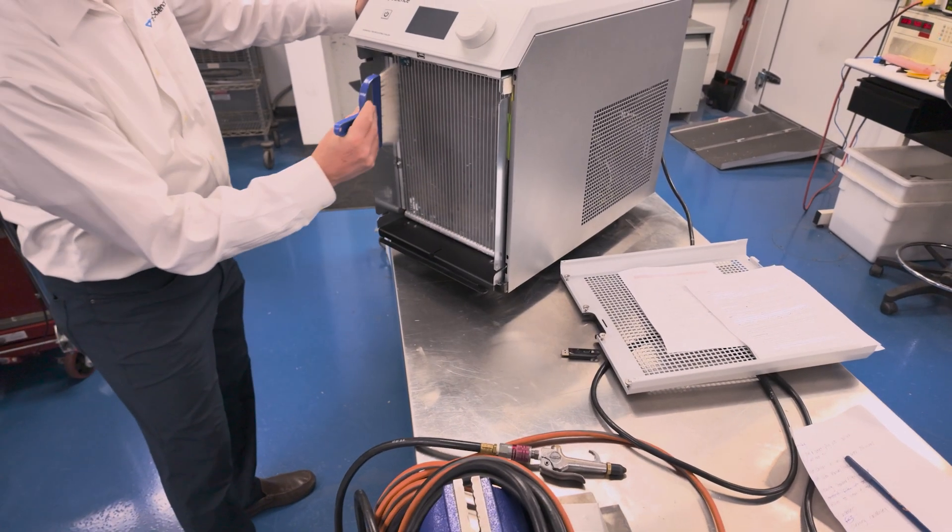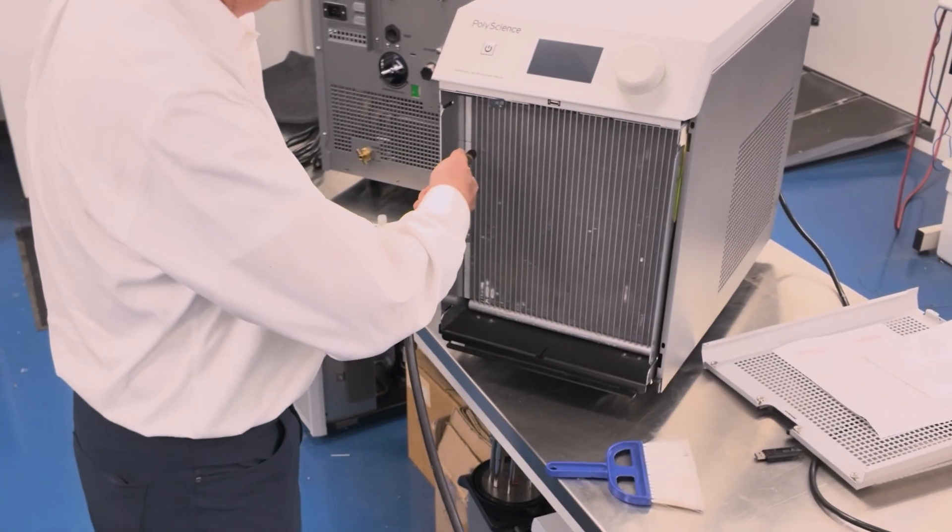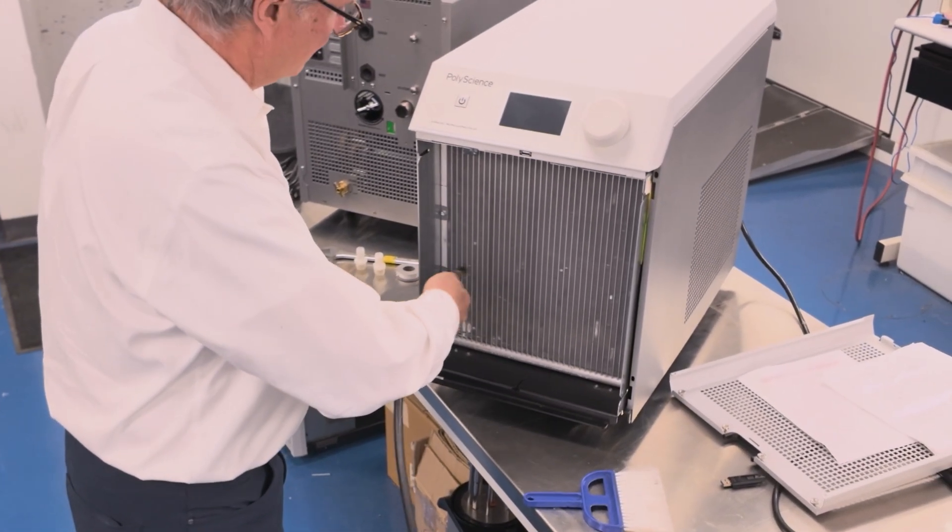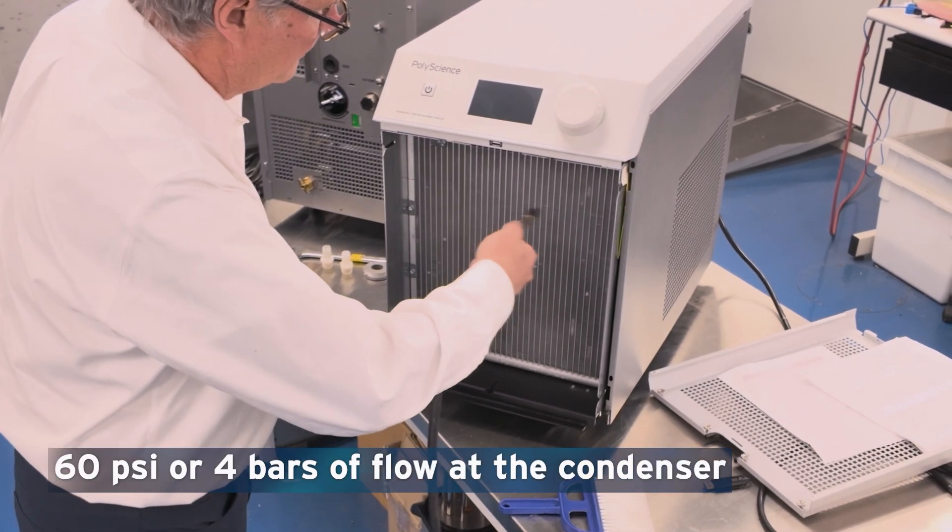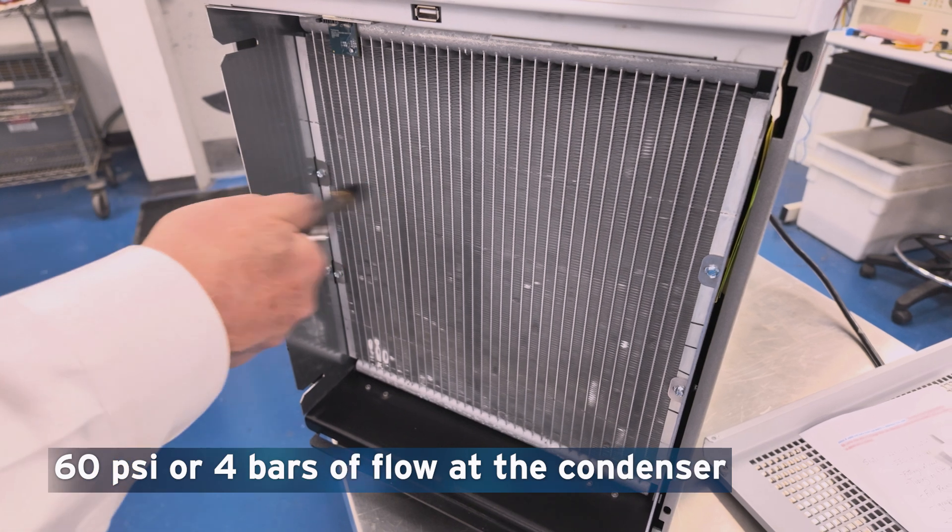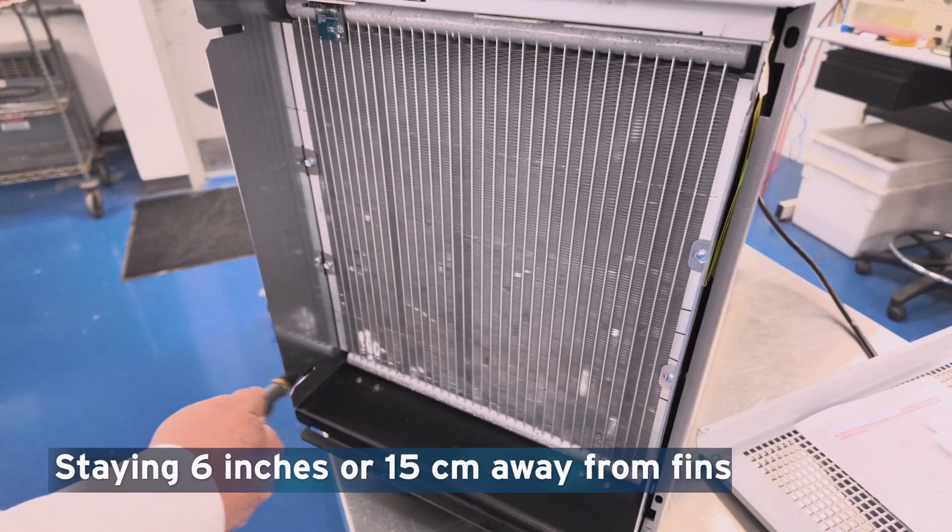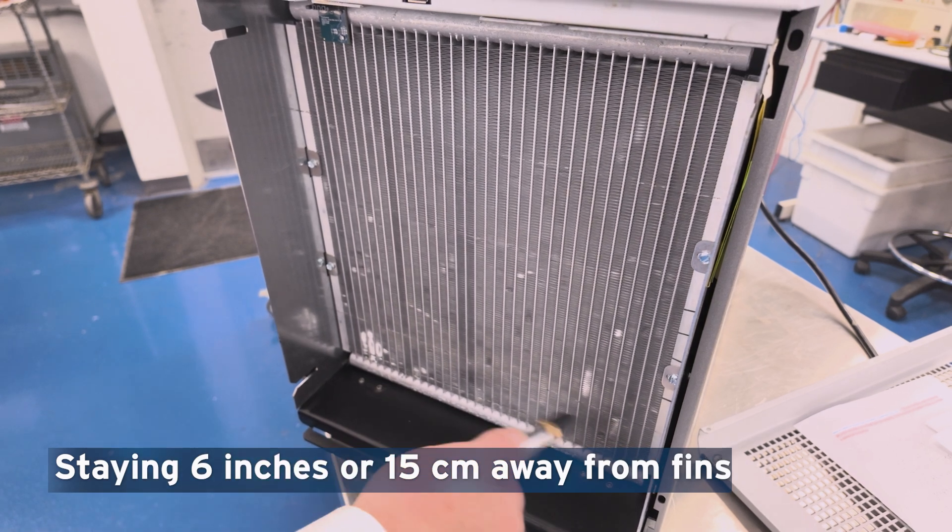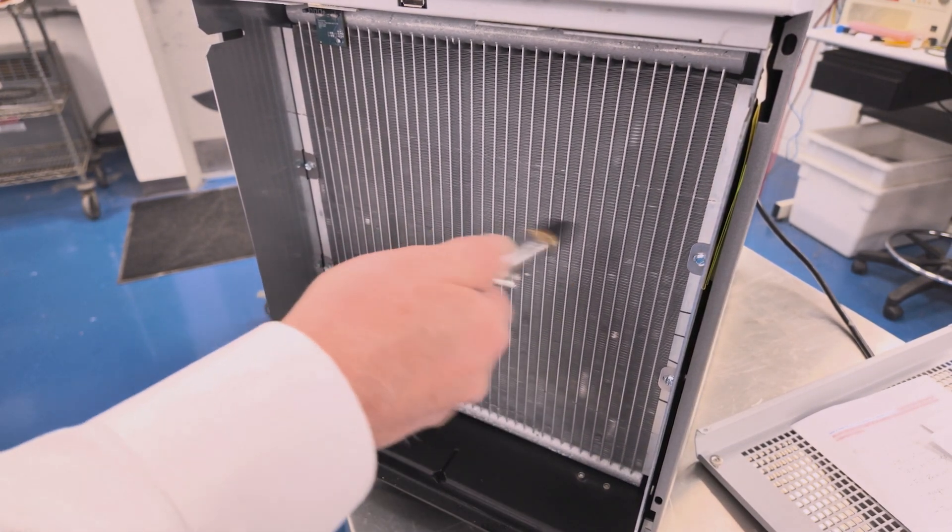To clean the condenser, use a soft brush and compressed air or non-flammable gas. Direct 60 psi or 4 bars of flow at the condenser, staying 6 inches or 15 centimeters away from the condenser fins. Use care not to bend the condenser fins.